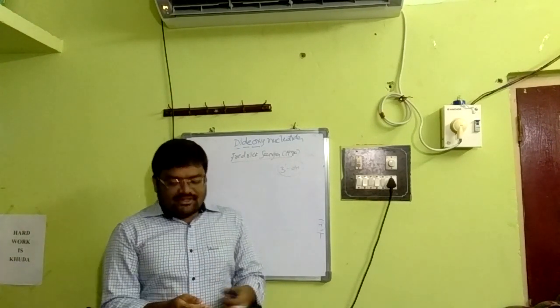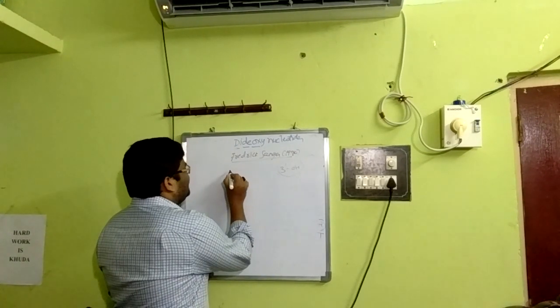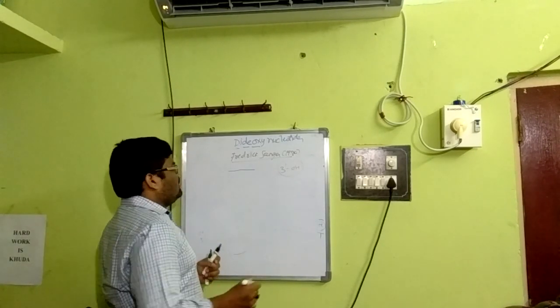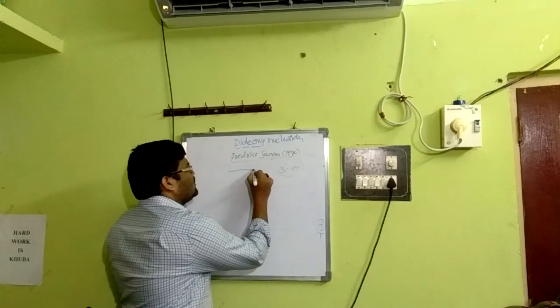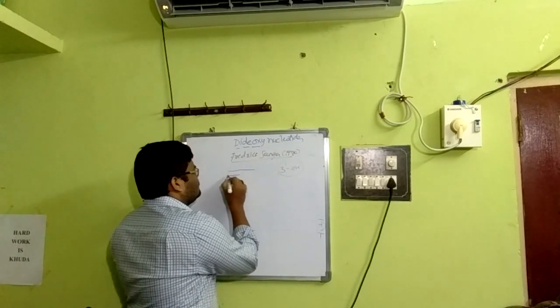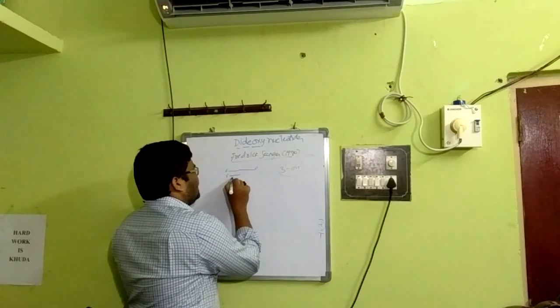Let's pick up a DNA template of interest. I will tell you how it runs. After that, we add a primer, as we knew. Say this is 3 prime. Okay, this is the primer.